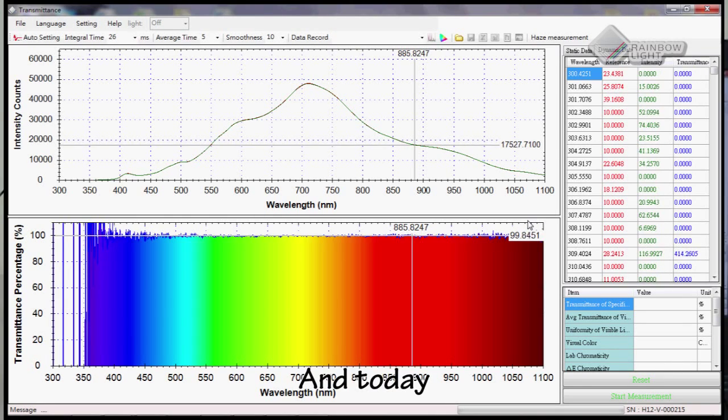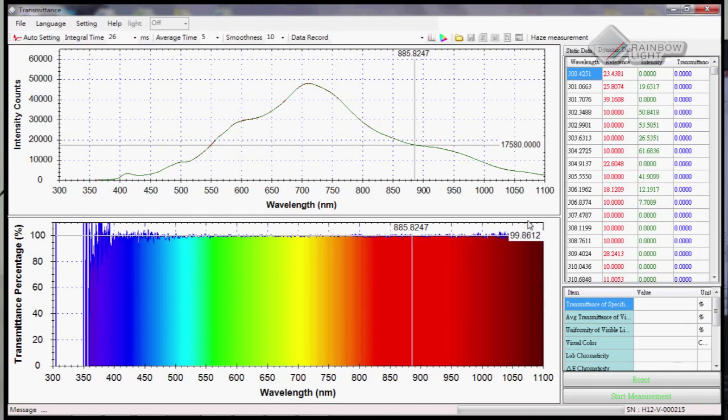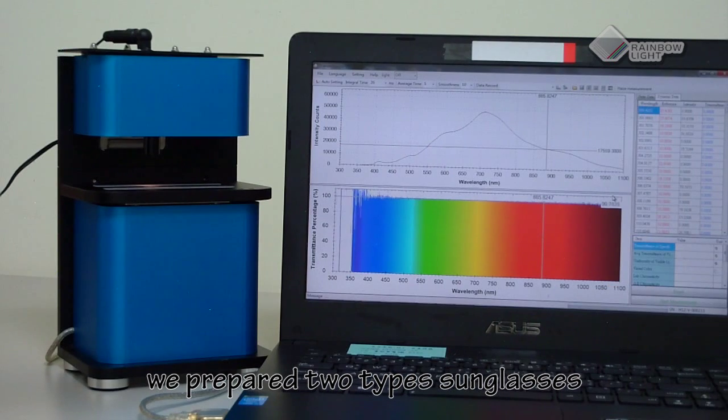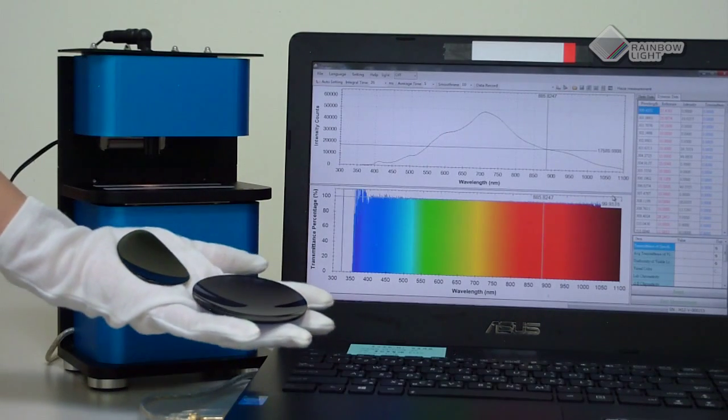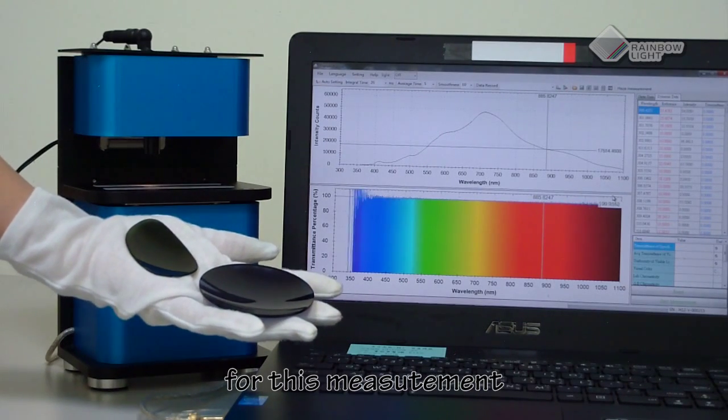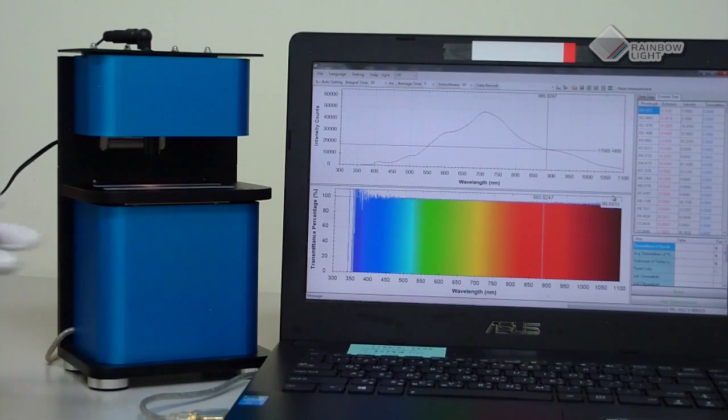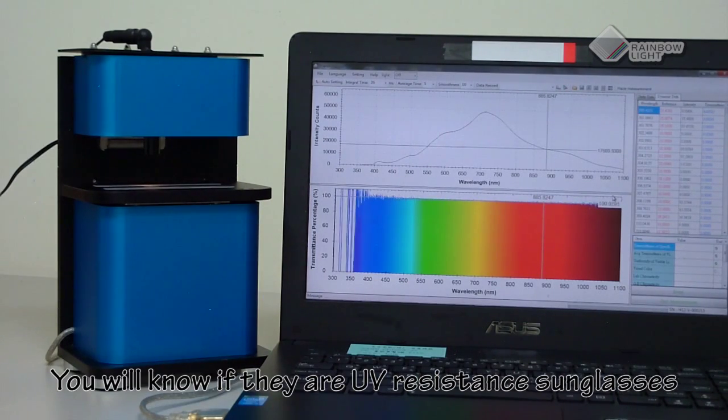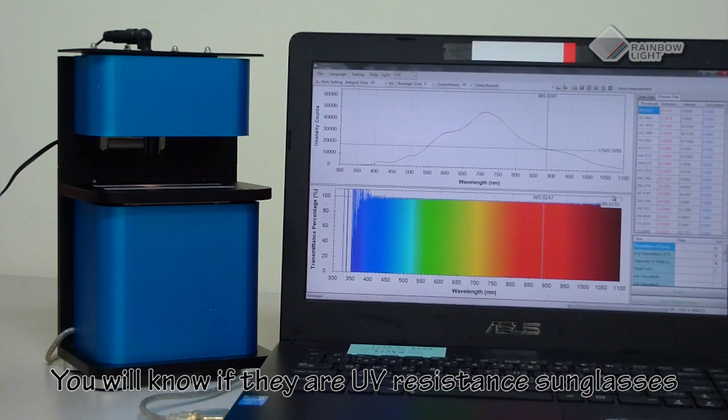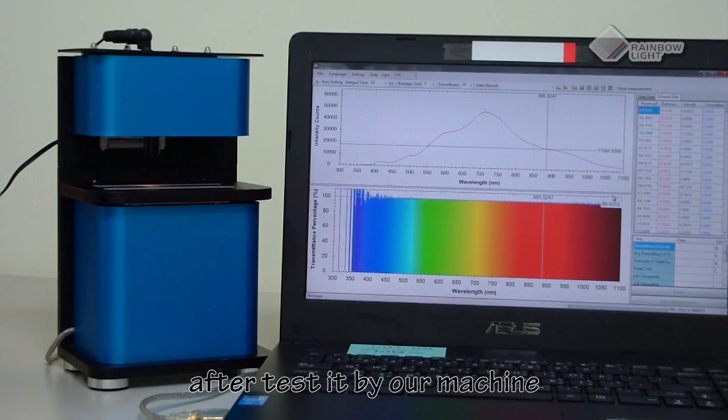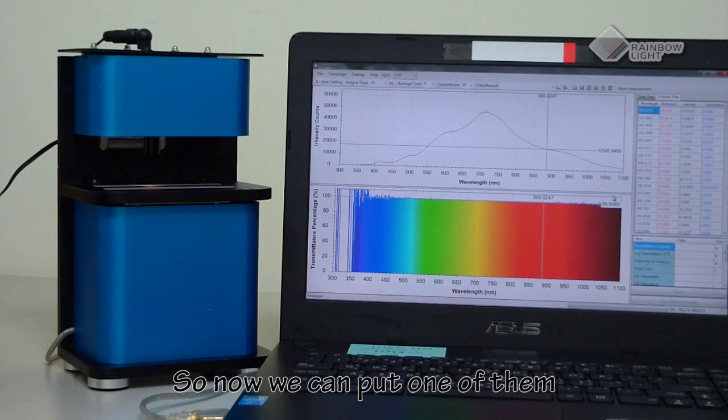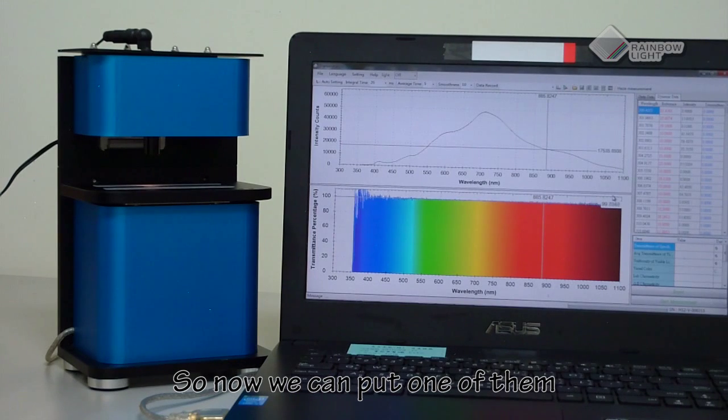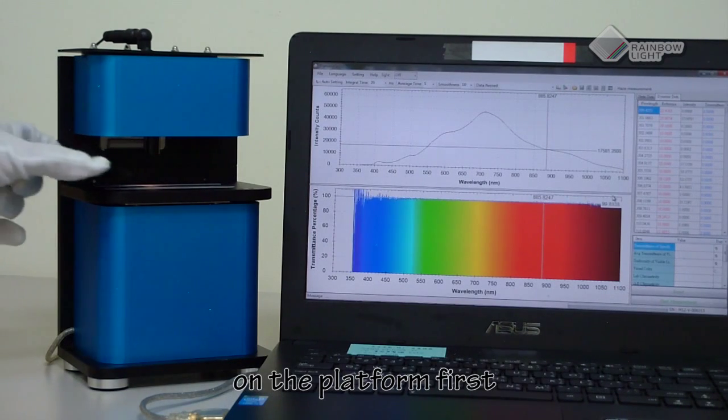Today we prepared two types of sunglasses for this measurement. We will know if they are UV resistant sunglasses after testing them with our machine. Now we can put one of them on the platform first.